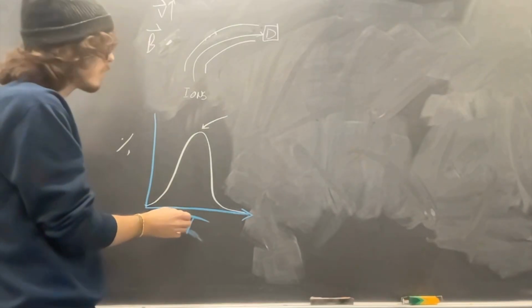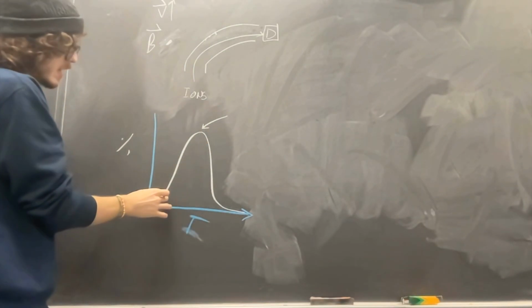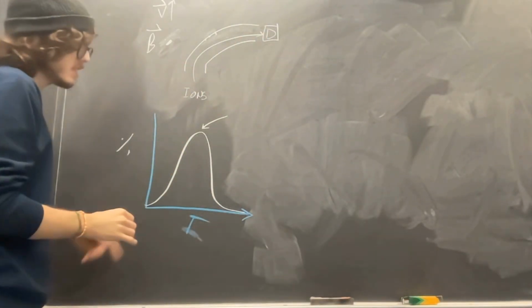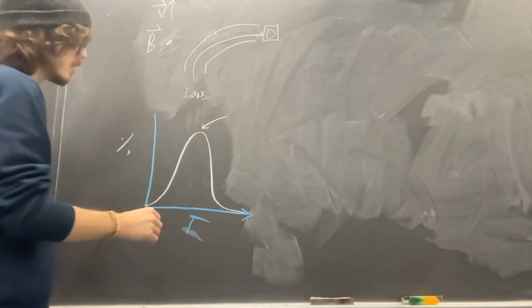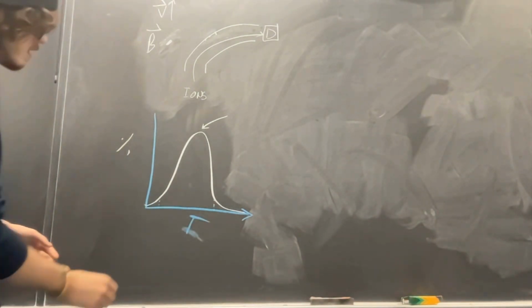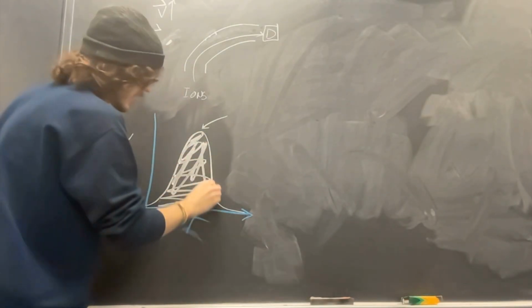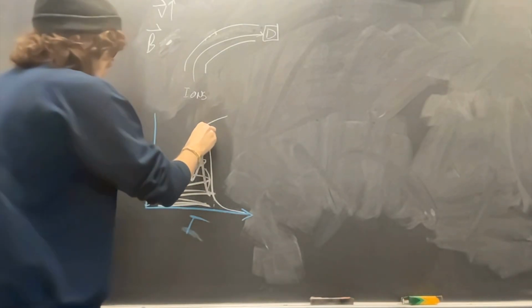So how can we avoid this? Because this is not selecting for that. It's taking all of these kinetic energies and shooting them towards the detector, and because they all have the same mass, most of them are going to be hitting the detector. I would say, except for extreme outliers, maybe beyond 2 standard deviations, all of these are going to be hitting the detector, and that's not good. We don't really want that.